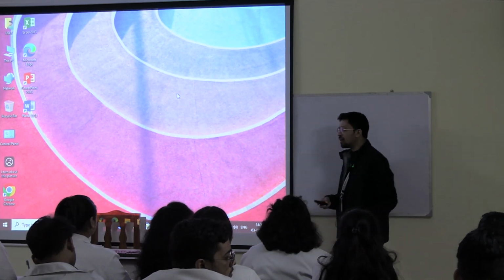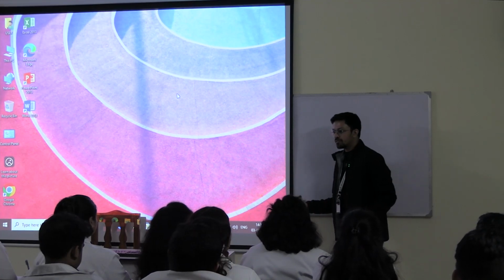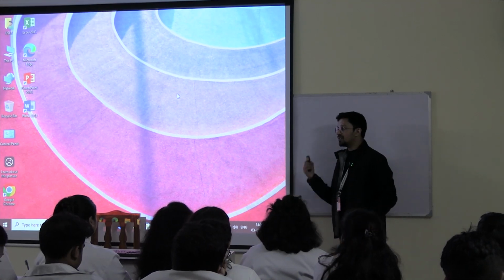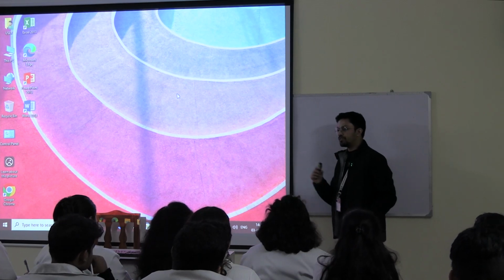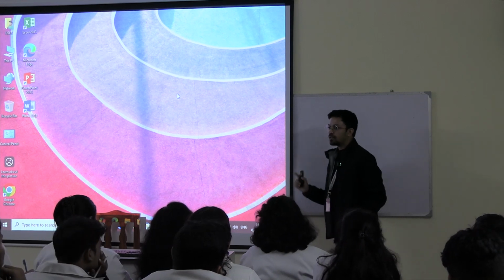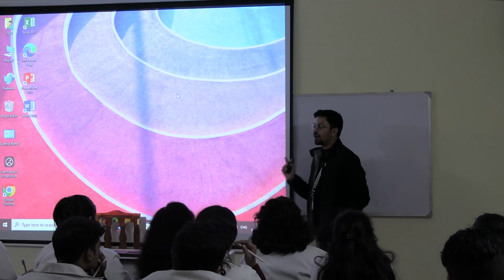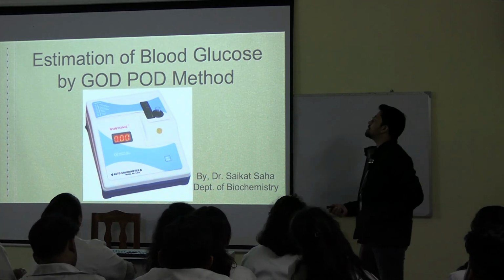Now, how we do the test is important. The theory class today will be very short and to the point, covering only what is necessary about how to perform the test. But one thing you have to keep in mind is that you have to be good with your pipetting. So, estimation of blood glucose by the GOD-POD method.